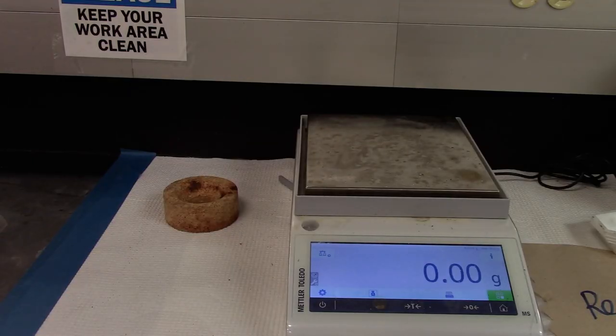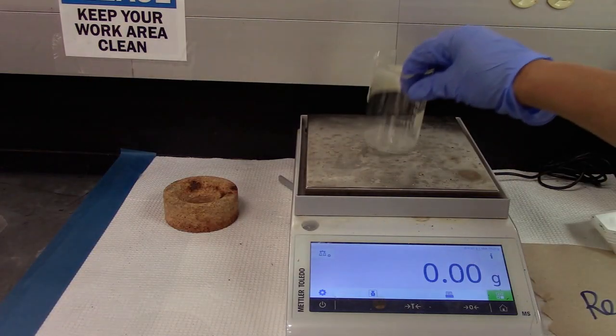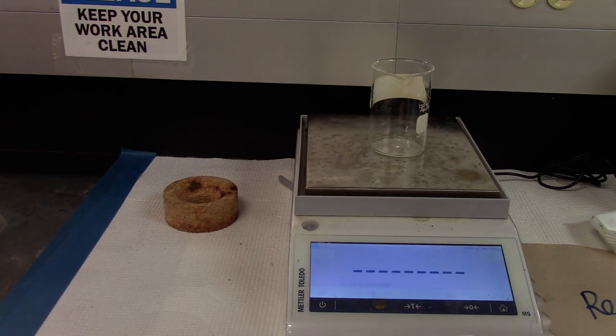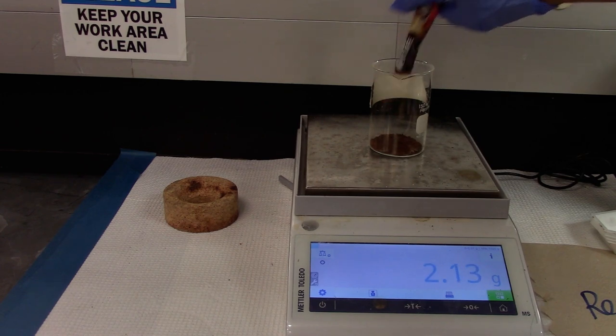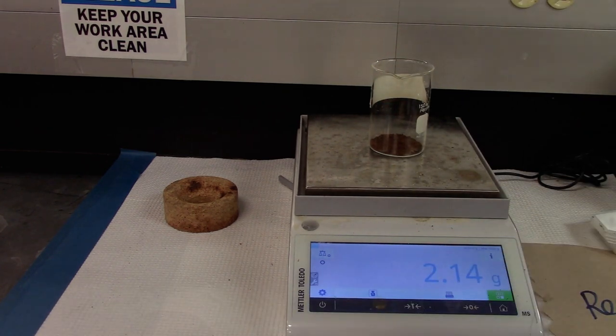Today we are working on extracting caffeine from instant coffee. Let's get started with weighing some instant coffee, about 2.5 grams. Tare a beaker and weigh about 2.5 grams of instant coffee.